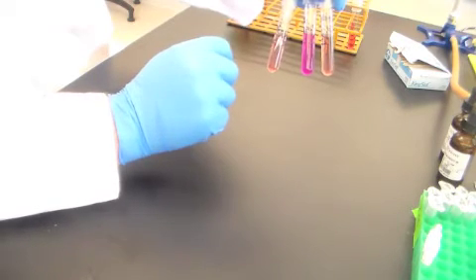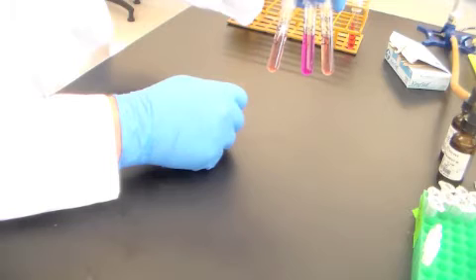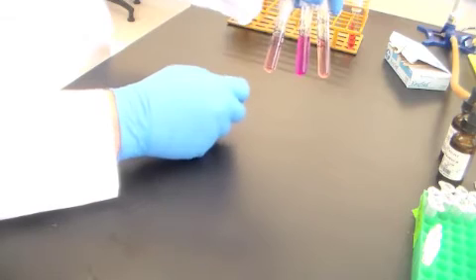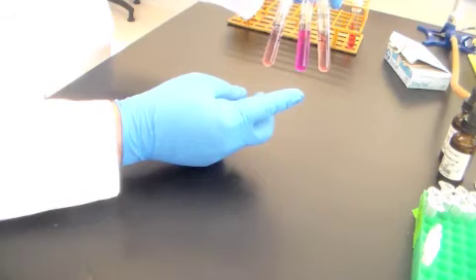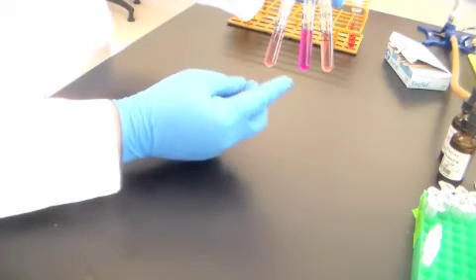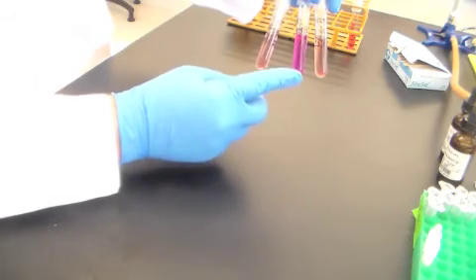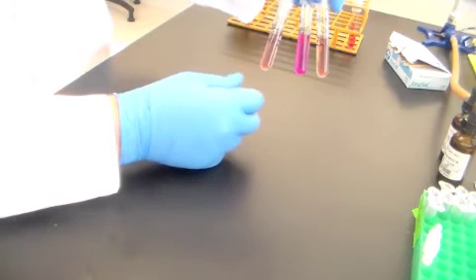If a bacterium possesses the enzyme urease, it will break down urea as a nitrogen source, and it releases both carbon dioxide and ammonia. And especially the ammonia leads to an alkaline reaction. So what you're seeing is that this particular pH indicator, phenol red, the same pH indicator that turns yellow at acid conditions, turns a brighter red, a fuchsia color, under an alkaline reaction. So when you see this color, this means that this bacterium has broken down urea and released carbon dioxide and ammonia.